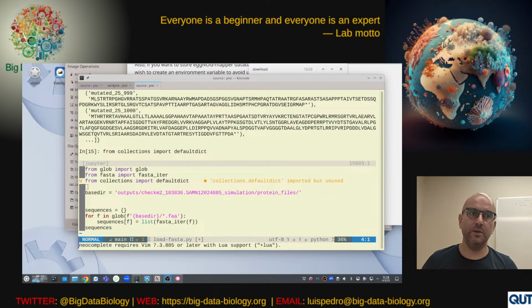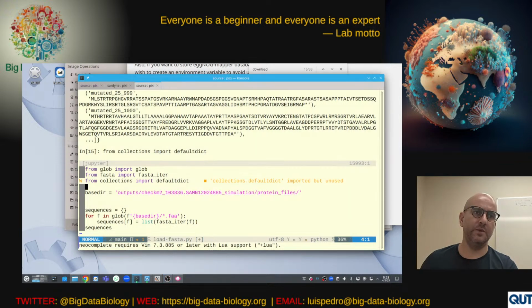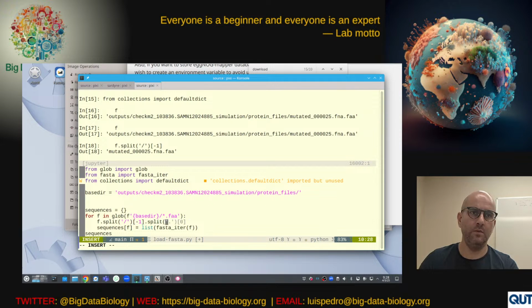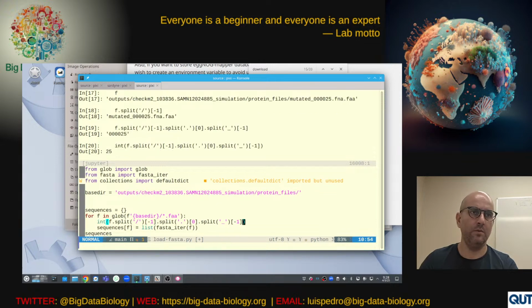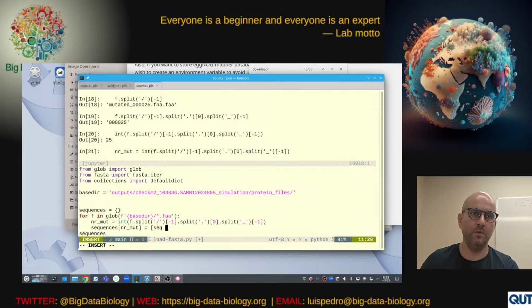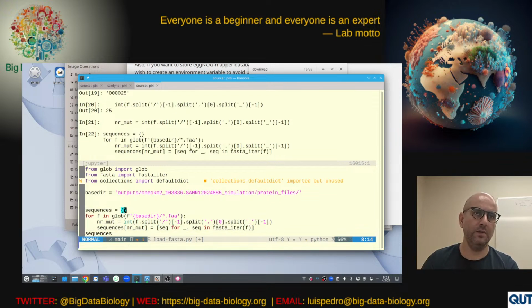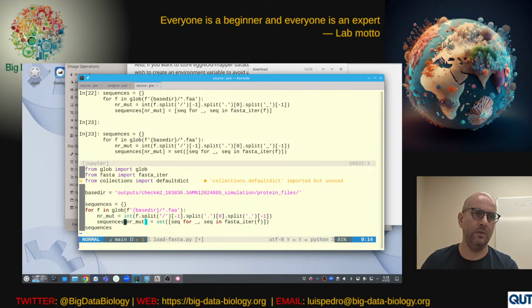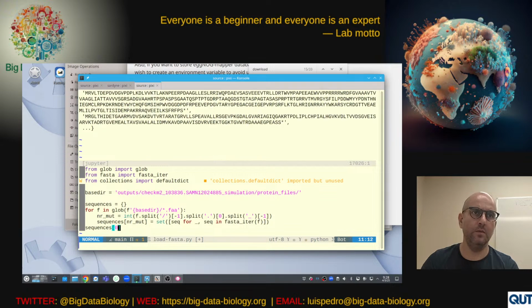If we think about it as gene sets, let's do it by gene sets. We'll do it like this.